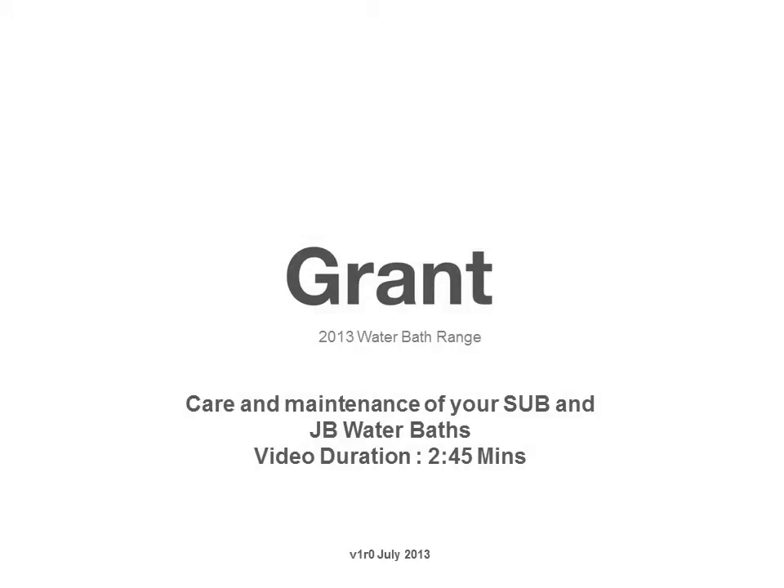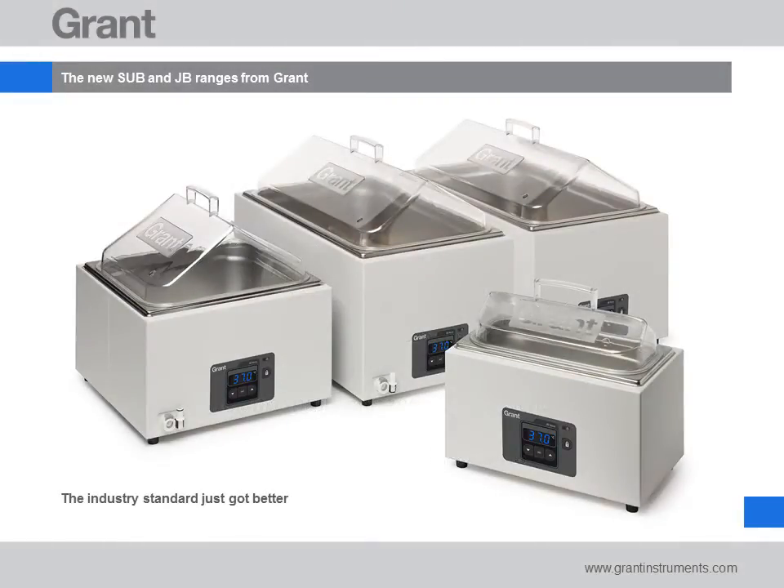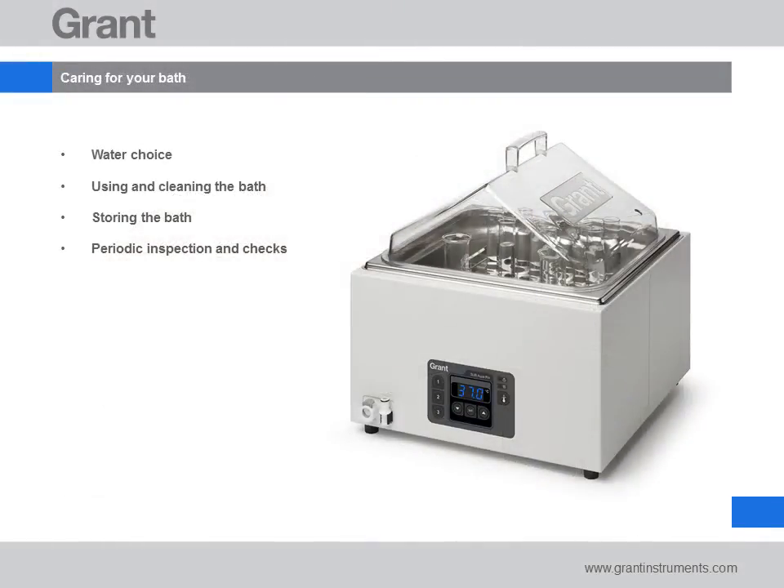Thank you for taking the time to listen to this tutorial on how to care for Grant's Sub and JB water baths. If you need any assistance after following this guide, please contact us — details can be found on our website. In this tutorial we'll cover the type of water to use with your water bath and how to clean, store and perform simple checks on your bath.